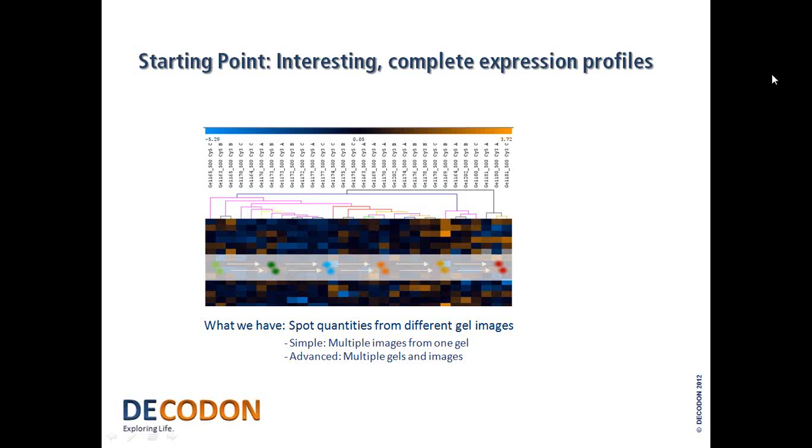Having complete expression profiles is not enough. We also want to focus on interesting ones, and this image here is just a symbol for doing statistical analysis to have only interesting expression profiles then.